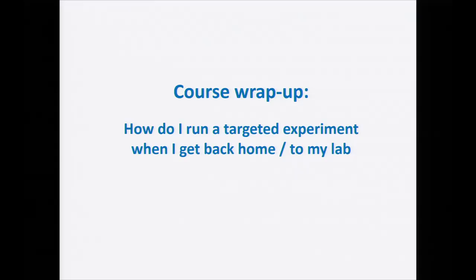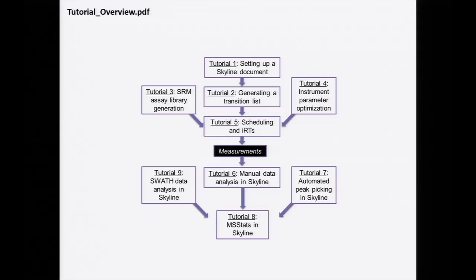But first I want to have a rapid summary of what you've seen, I hope, during this week that was interesting for you, and all the different steps that you need to think about when you go back to your lab and want to run your targeted proteomic assay. So for this, I'm going to use the chart that was used in presenting the tutorial overview, and this presents basically the different tutorials that you went through during the week, and just shapes this a little bit differently, with really the different steps that you need to go through when you devise a targeted proteomic assay.